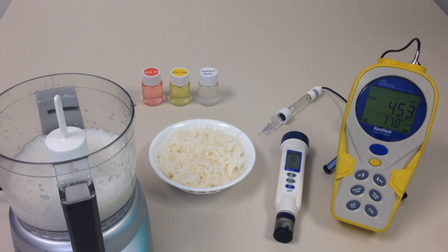It's important to know the pH of your sushi rice because in many states, sushi rice must be between 4.1 and 4.6 to be considered safe. If it's under 4.1, there are certain pathogens that grow in it, and over 4.6 there are other pathogens. I recommend that you check with your local health department to find out the specific rules they have for your sushi rice, but the general rule of thumb is between 4.1 and 4.6.